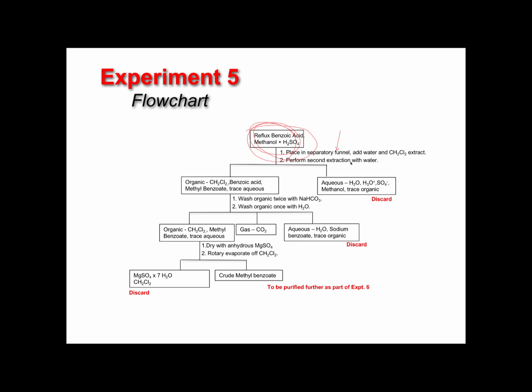And I think actually what we've done is we've changed this in the procedure. You'll see in a slide in the future, in a couple of minutes, I think we've decided to do 3 extractions with water and then extractions with bicarbonate. So you'll see this. There may have to be an adjustment to this flow chart. So pay attention as we move through the slides. You see again how we're doing the separations, and we're following, okay, where do we get rid of these impurities? How do they disappear from the setup?